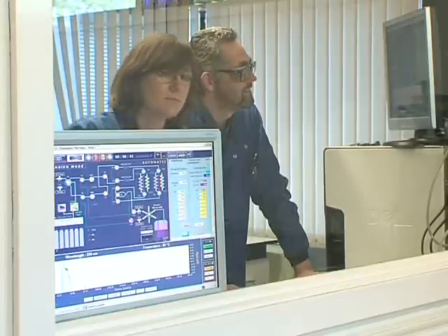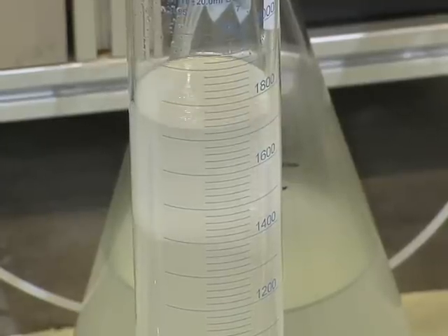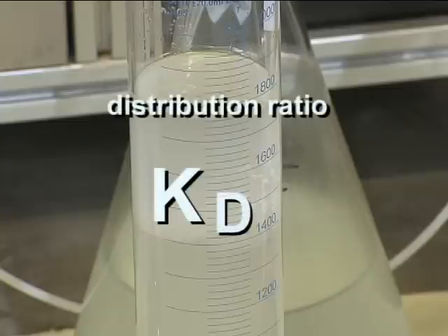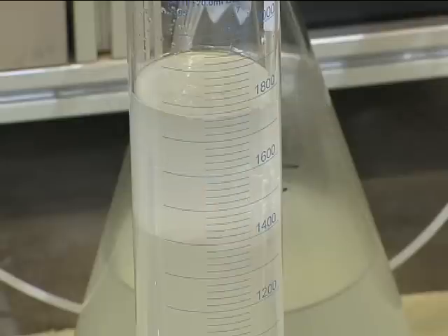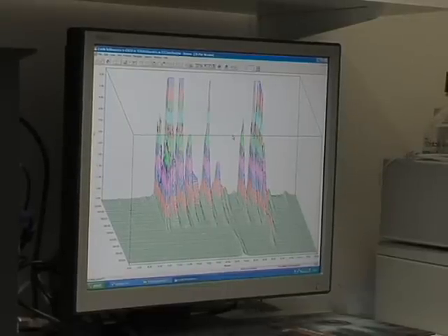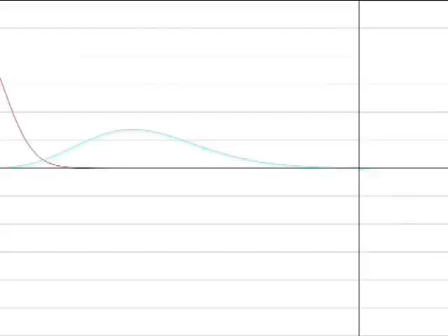All this generates high resolution separations based on each component's differential partitioning behavior in the phase system, which is characterized by the distribution ratio KD. Determining the distribution ratios of the main components in a mixture allows the countercurrent chromatography purification to be predicted with amazing accuracy. Here we see a prediction of two components eluting from the countercurrent chromatograph, one with a distribution ratio of 0.5, the other with a distribution ratio of 2.